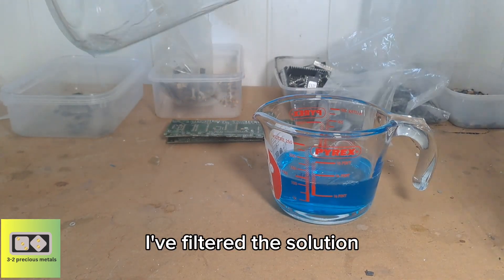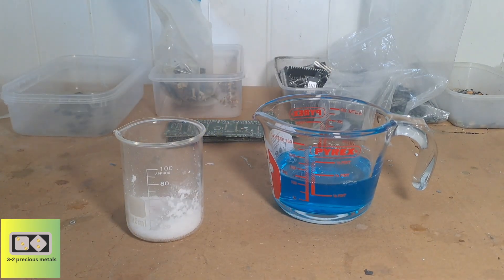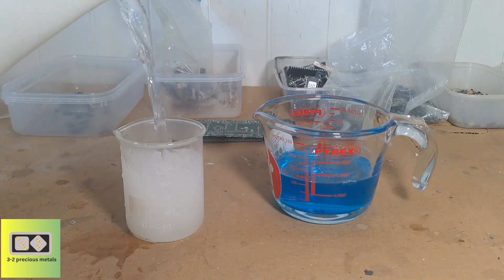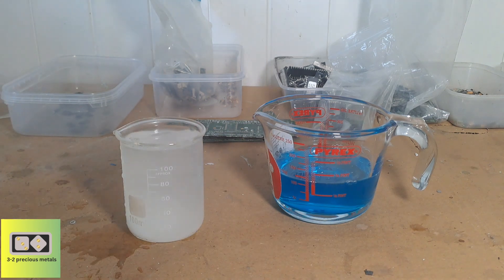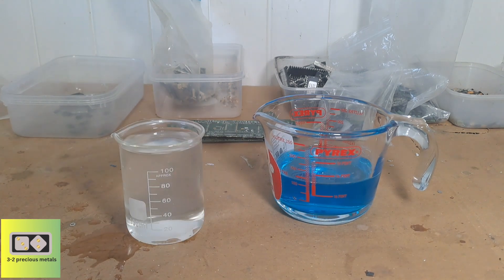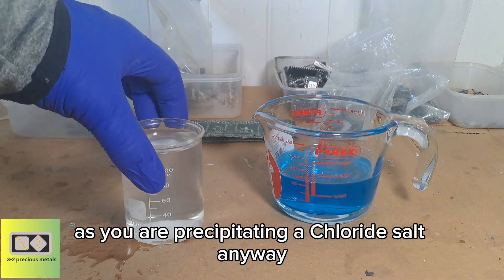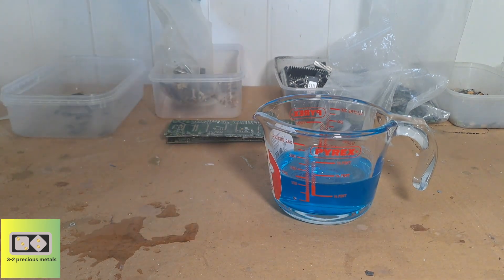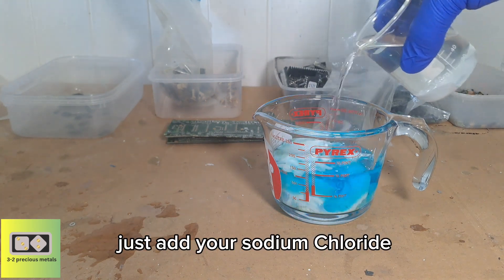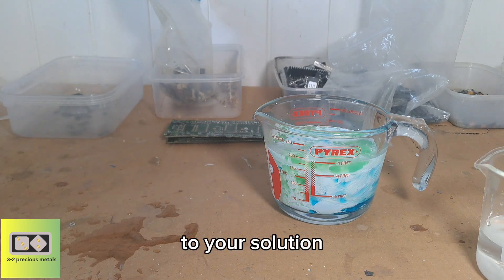I've filtered the solution. I'm adding table salt dissolved in hot water, and then we add the sodium chloride to the solution to precipitate the silver chloride. You can use tap water for this, as you're precipitating with a chloride salt anyway — any chlorides in the water won't be a problem.